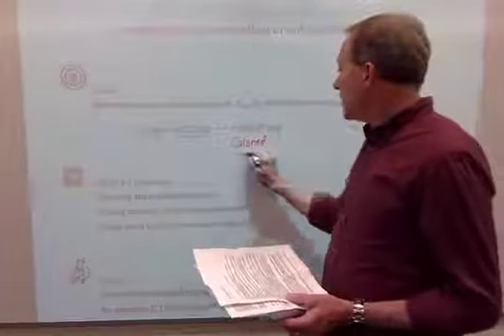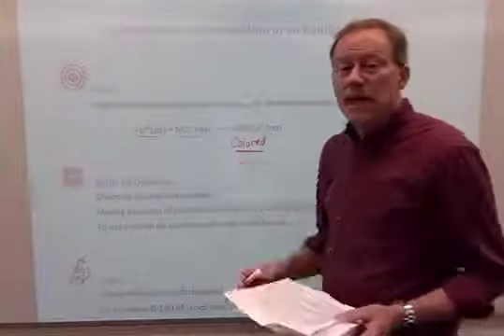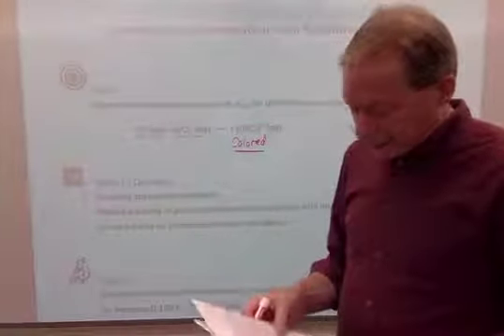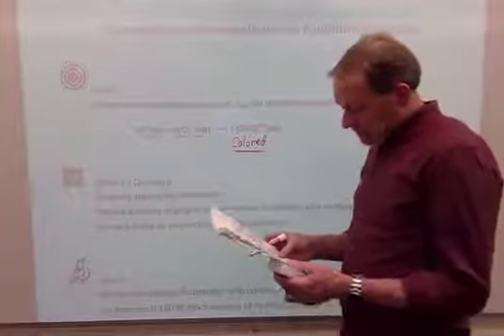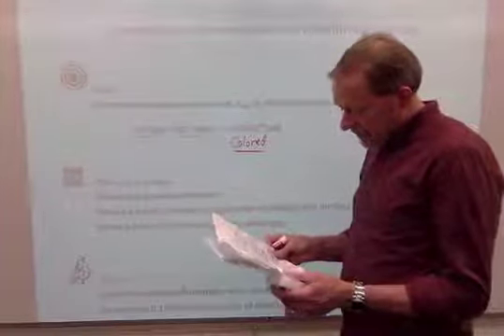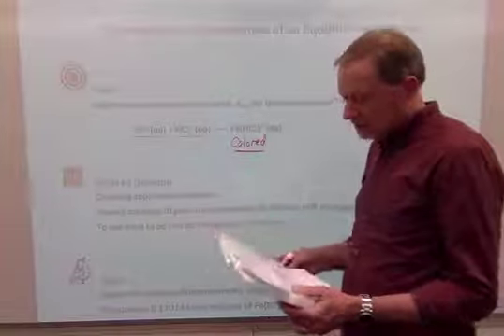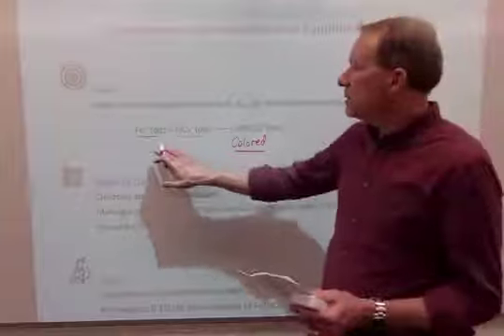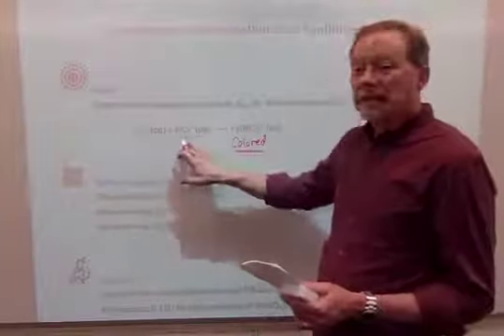And that is how we're going to measure the amount of this new product that's formed. And so we have to talk about using Beer's law to determine that concentration. We're going to use Beer's law to do that. And let's take a look at this equilibrium. So it's a fairly simple equilibrium involving two reactants and a product.